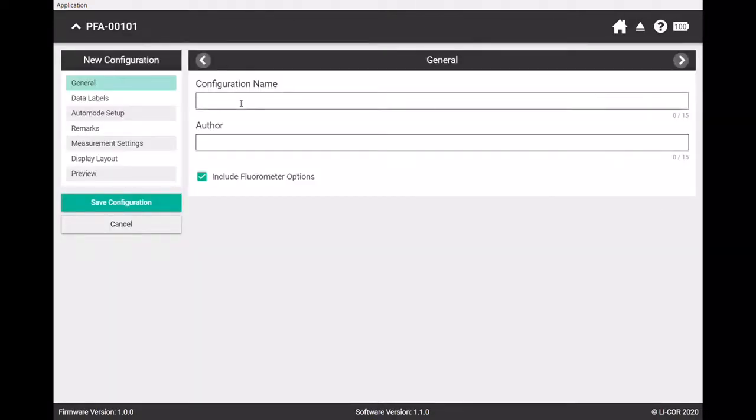And we will create a new configuration. I'm going to name this one test. For the author name, I will give it my name, CC, and I will include the parameter options.